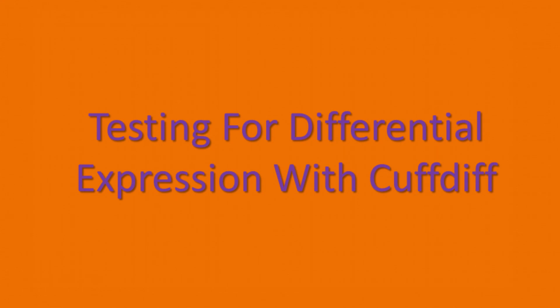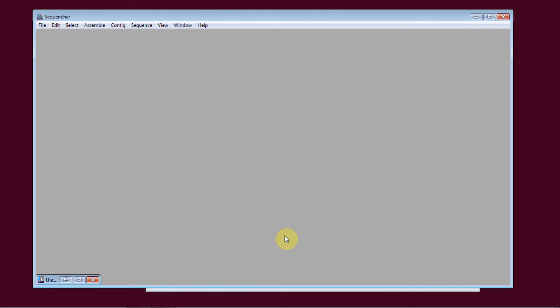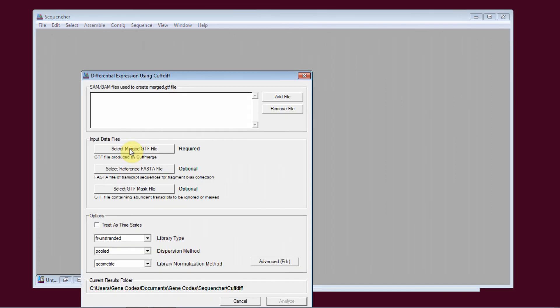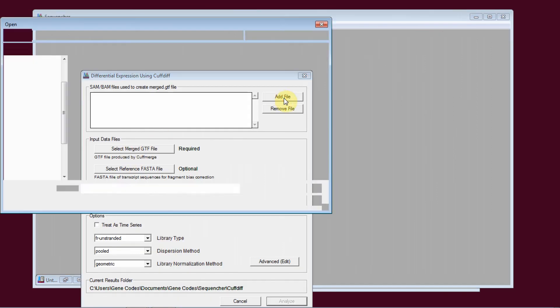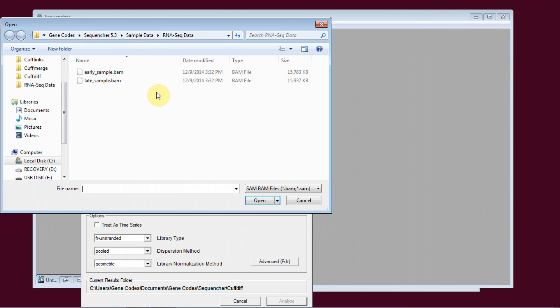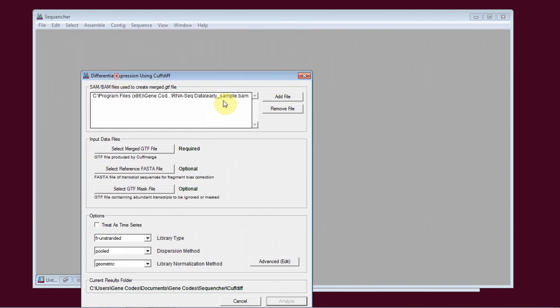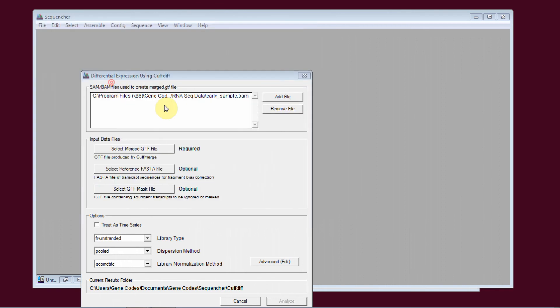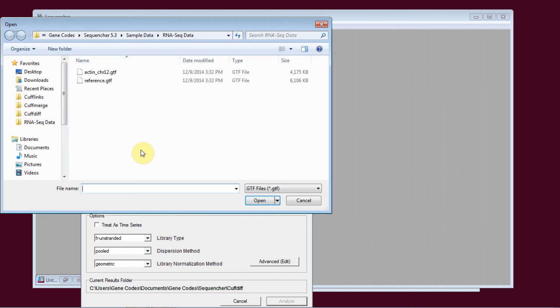The third step is testing for differential expression using CuffDiff. I go to RNA-seq differential expression using CuffDiff. I select the original BAM files that I used in CuffLinks.